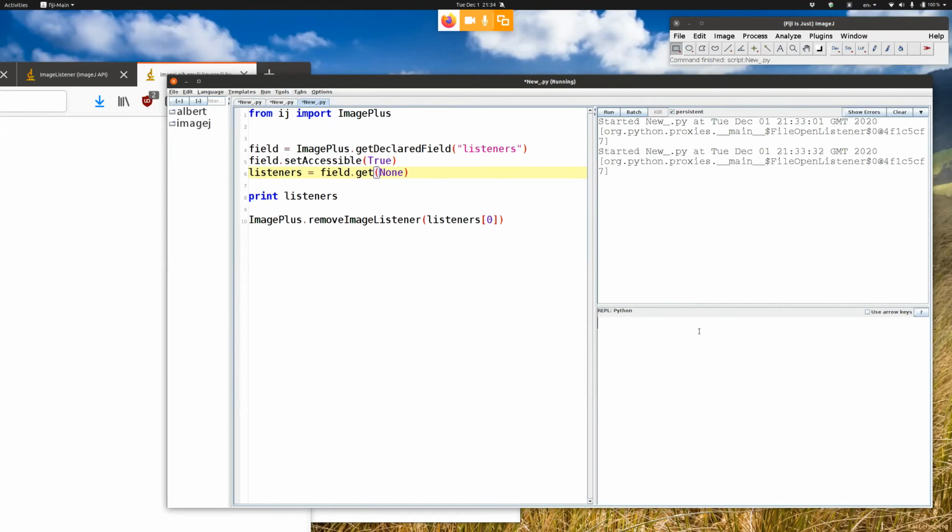I'm following and writing along as I go, and I'm getting the error that the name ImagePlus is not defined. Oh wait, no, actually it's in the top line. That's what I had. Yeah, this means you didn't import it. So very recently, I implemented auto-completion for Java classes into the script editor for Python scripts. It may or may not be in your Fiji, depending on whether you did an update close enough to the session. Otherwise, you may have to write them by hand.